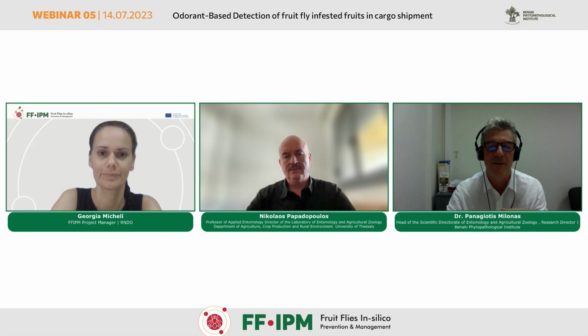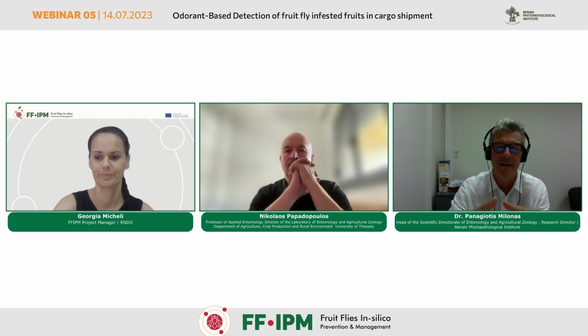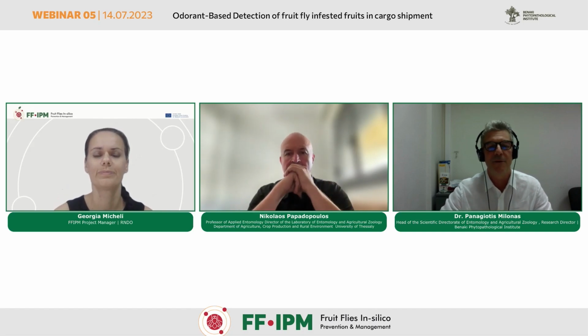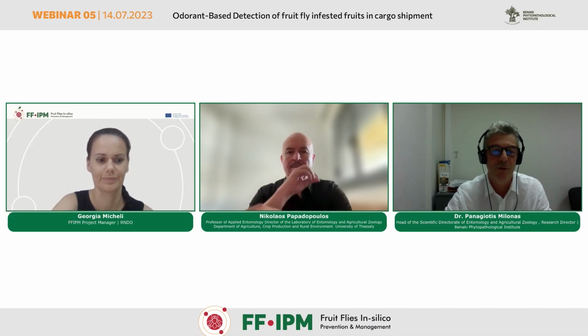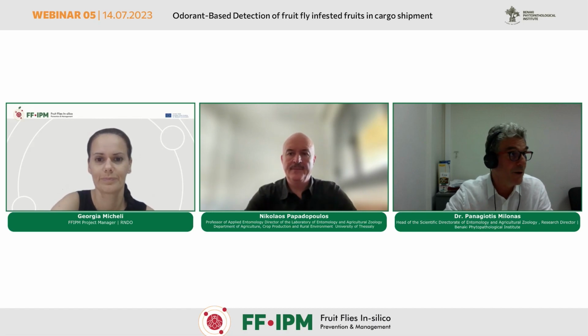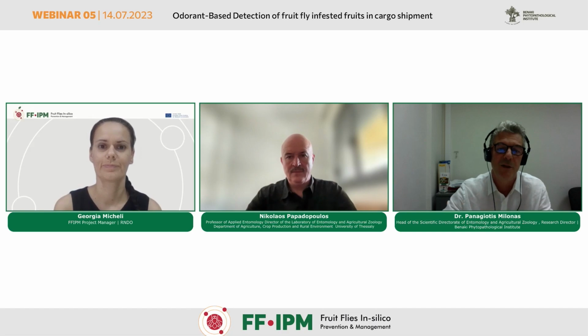And if it's positive, then of course, at the beginning you need to verify that it is positive and find the fruit fly, because especially for the inspection for quarantine purposes, you need to identify the species as well. And what the machine can do is speed up the procedure for reaching a conclusion that the commodity is infested.